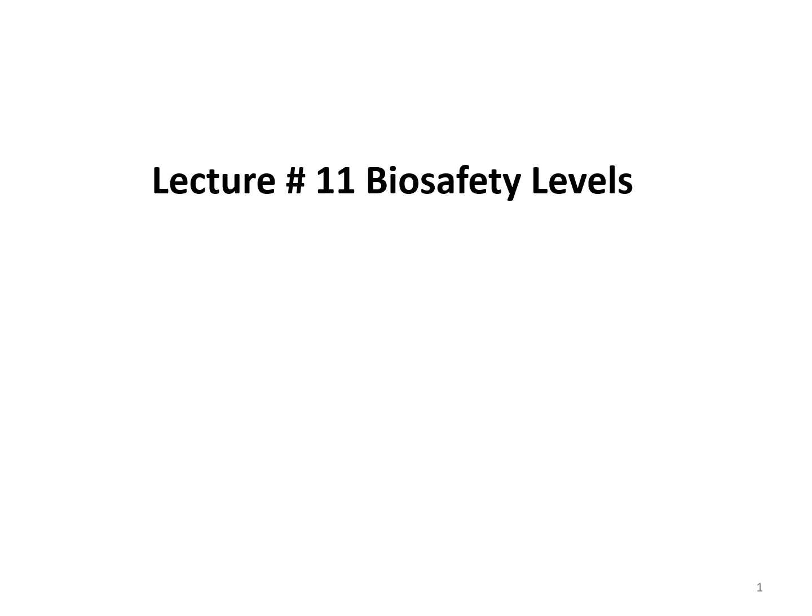Good morning, students. In the last lecture, we discussed different pathogens and microorganisms, their routes of transmission, as well as lab-acquired infections and some data from different organizations. In today's lecture, we will talk about different biosafety levels and how different organisms are divided into them. There are four levels according to the severity and nature of the microorganisms, and we will talk about all four.